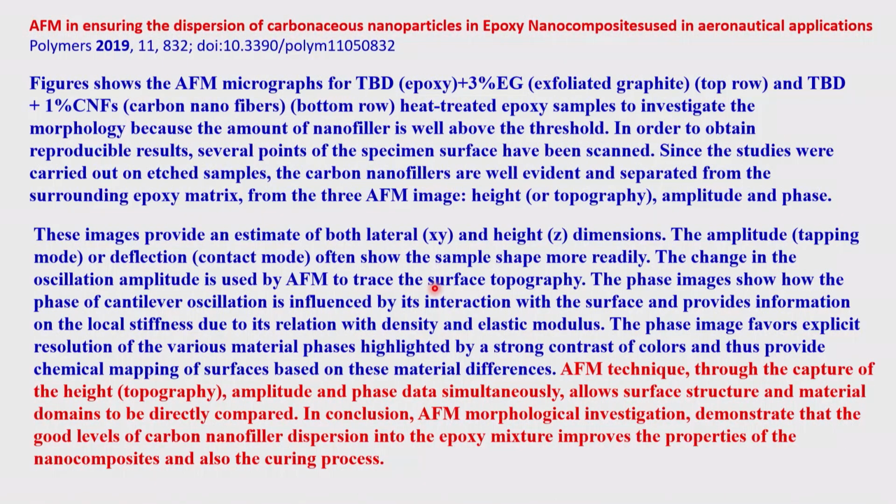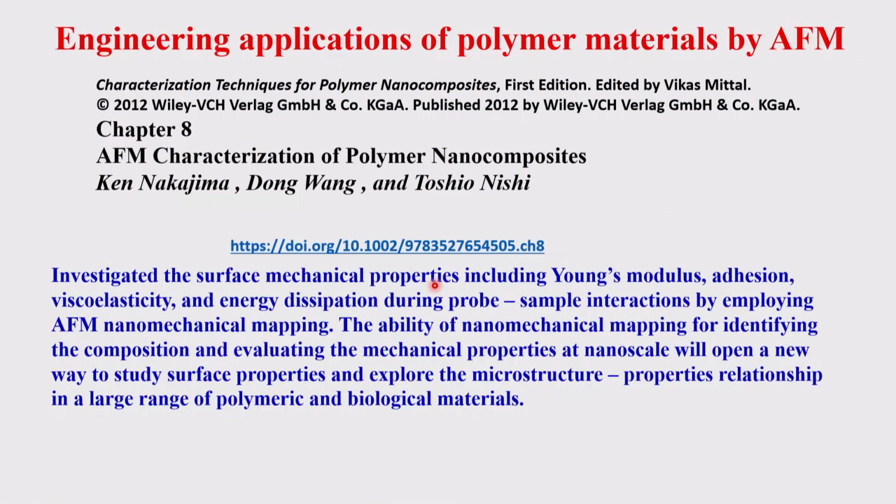Okay, and that's what more details are given on this particular slide. And AFM can also be used for a large number of, as I just told, engineering applications. So let us look at one engineering application of a polymer by AFM. You can investigate the surface mechanical properties including Young's modulus, adhesion, viscoelasticity, energy dissipation, all these kinds of things, as a mechanical mapping.